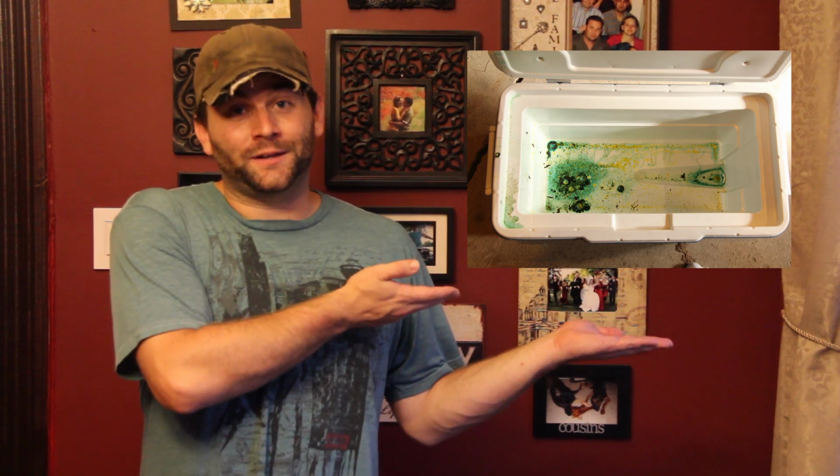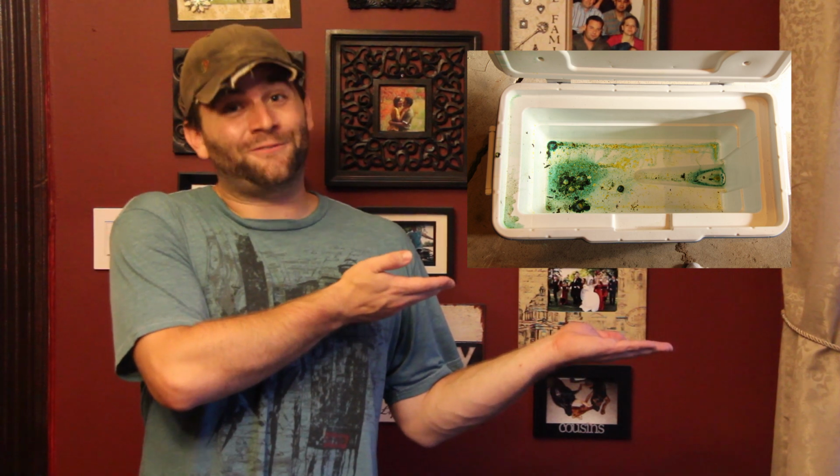It's not very pretty. But I have to admit, when I first saw it, I was curious to find out what it was. Now, I've been Googling this stuff to try to find out exactly what it is. And as far as I can tell, it's disgusting. But in all honesty, it's probably some type of mold or fungus. The closest I could find is it's the mold that we make penicillin from. But I really just don't think it is. The pictures really don't match up.